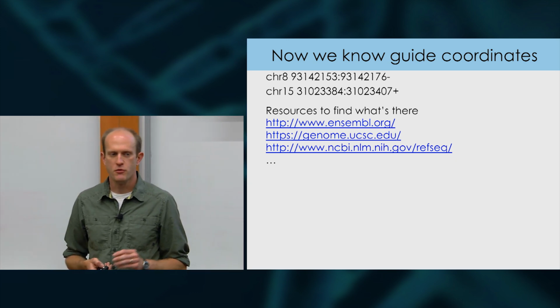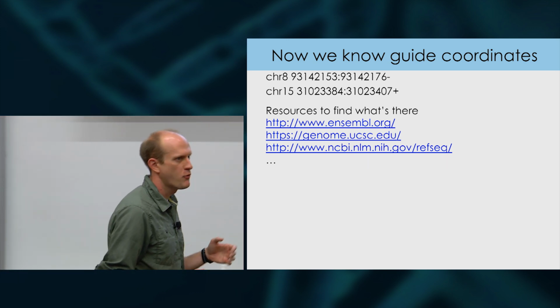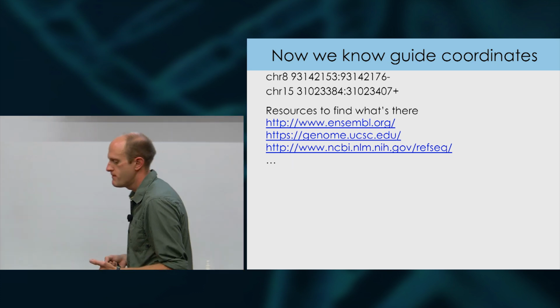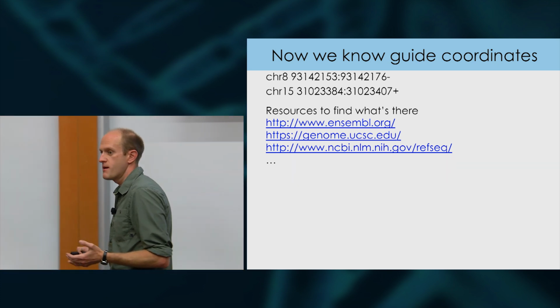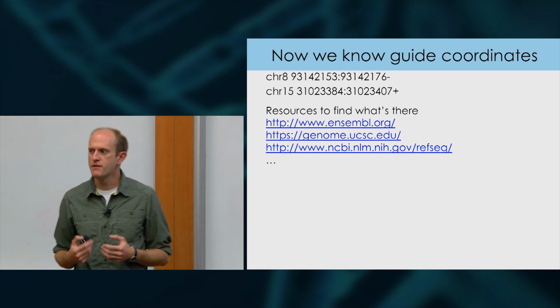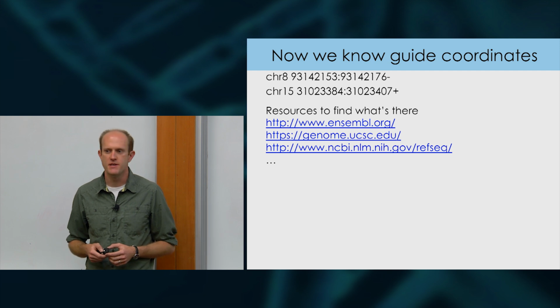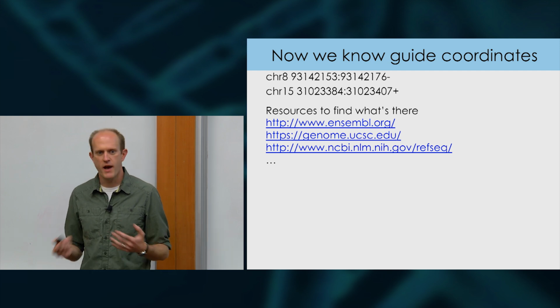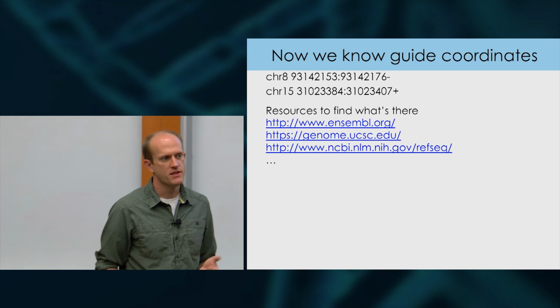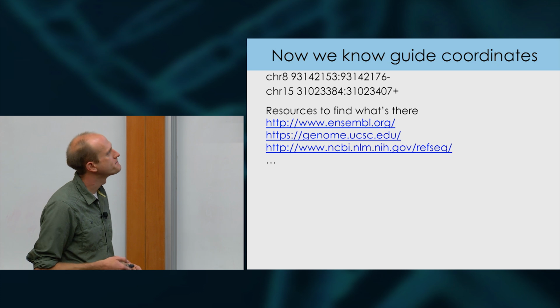For example, knowing where transcripts are. Just thinking about where a transcription start site might be sounds like a very obvious thing, but there are active projects out there to try to better map transcription start sites. You might imagine that if you're doing a CRISPRi or CRISPRa experiment, knowing exactly where that TSS is going to be is quite important. If you're just trying to do exon mapping, that's maybe a little bit less important. We have a pretty good idea where exons are in the genome by now. But designing CRISPRi, CRISPRa guides can be a little bit more subtle.